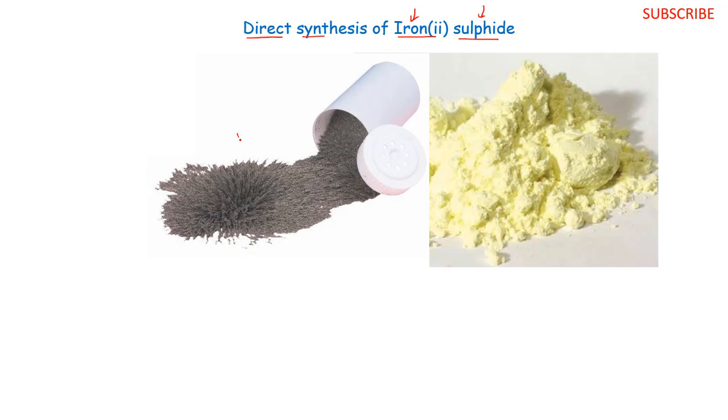So here we have our iron filings. If you have ever played with a magnet, either in class or outside class, you might have come across iron in this form, basically scraps of iron particles. So we have iron filings and it's basically gray in color. And then we have our powder sulfur, sulfur in powder form, basically yellow in color.